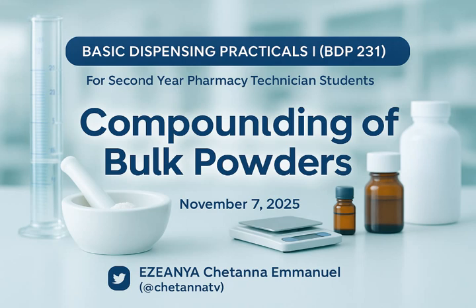You take 40 grams from this and put. This is what you keep doing until you exhaust this one. If you do it well, you have properly mixed the 2 powders. That's what we call geometric what? Dilution or doubling up. Is that clear?